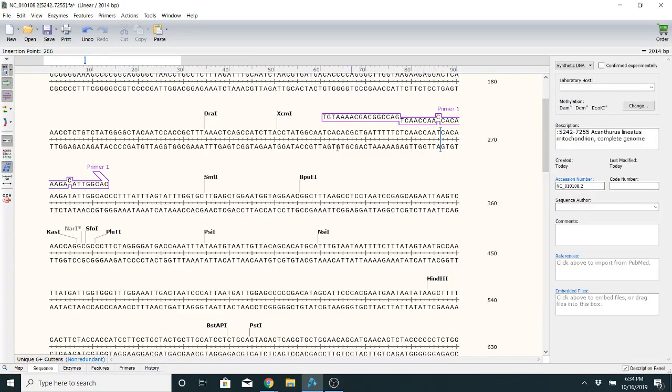Now these genes that are picked for DNA barcoding are very conserved, so they don't vary very much, and they're always there. This one's a mitochondrial gene that you're not going to live if you don't have, at least if you're anything with mitochondria. And so even though there are small variations, they're long and they're very similar. So sometimes when you're doing things where there is variation genetically, you can get differences that you don't necessarily expect.